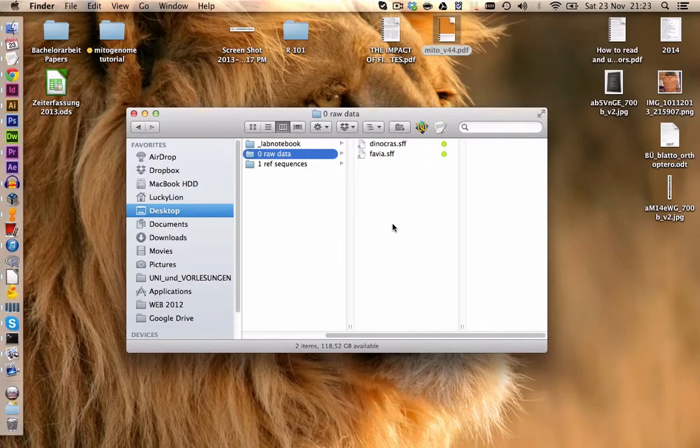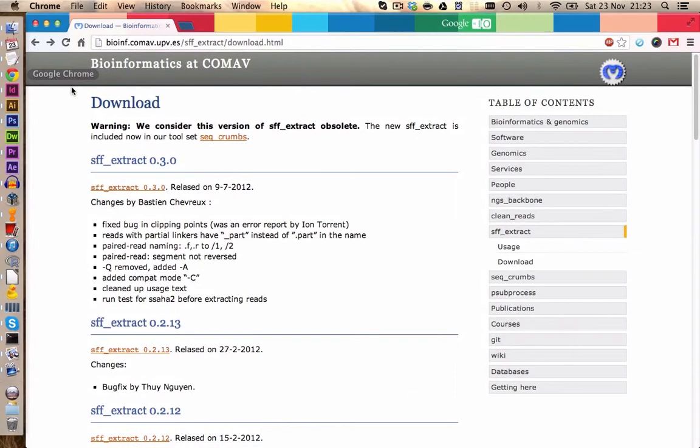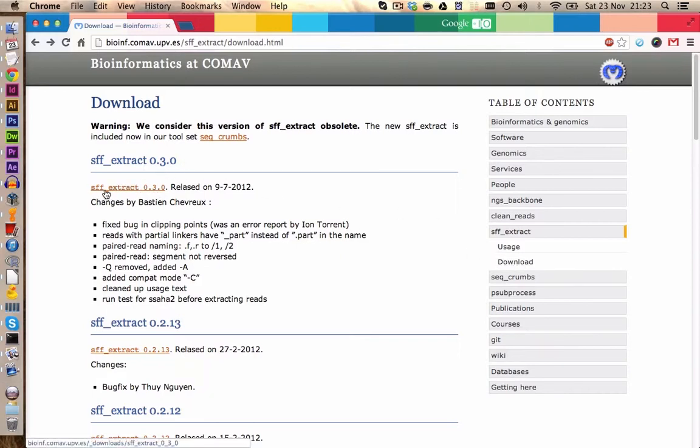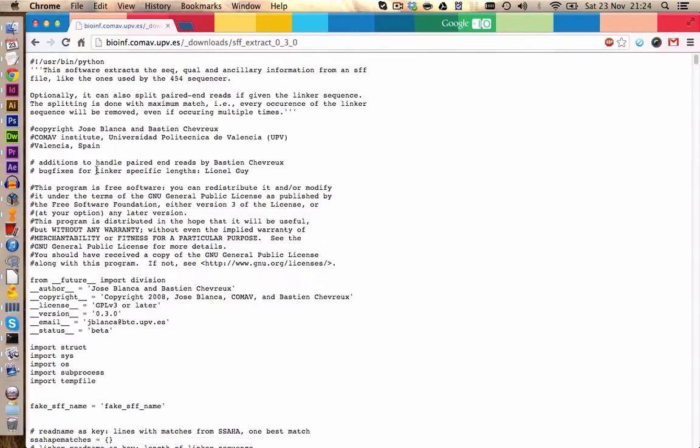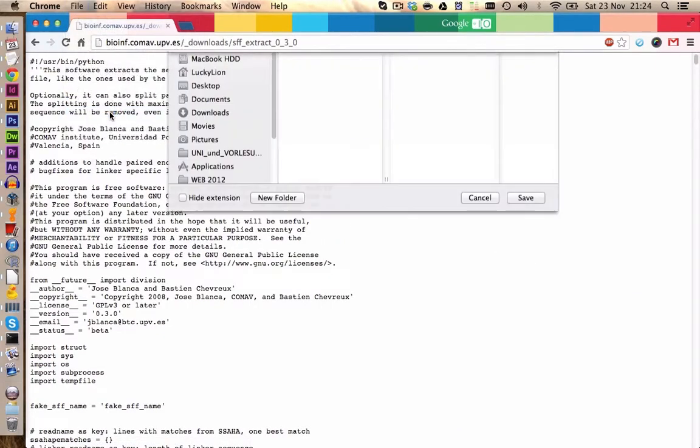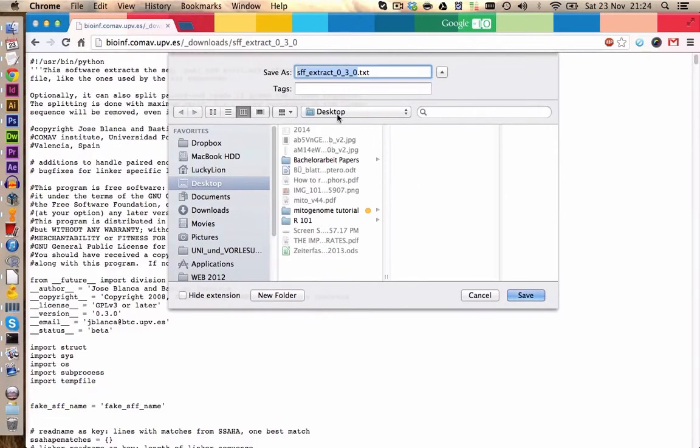First of all, we need to download the script to extract our files. You find the link in the YouTube description below. To save the script, click on download here and on SFF extract 3.0. Here you can click on file, save page as and we are going to save this one as a PY file and we save it for now on the desktop. Click on save and now we put this file into our folder to our raw data.